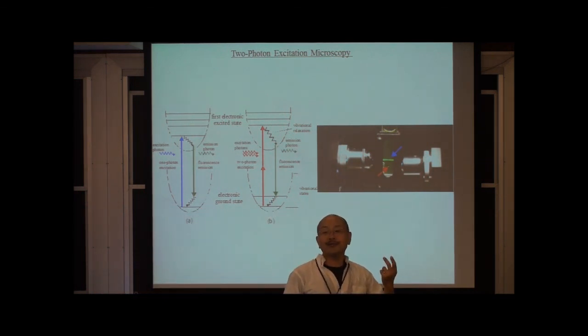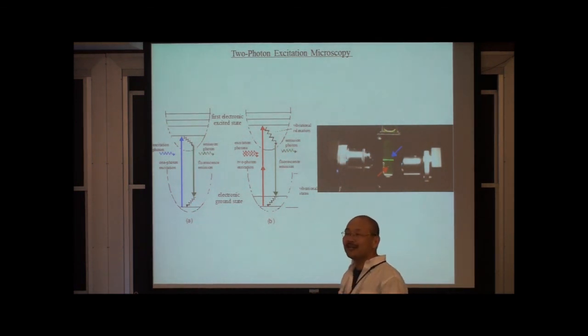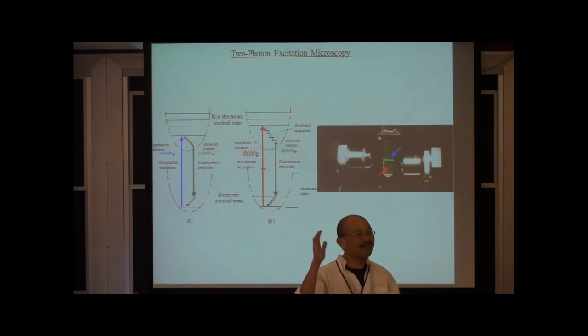You guys all used little lasers in the lab the last few days, including the little terrible blue laser pointer that generates terrible optical spots. But those are cheap laser pointers, $300. We decided to buy them so that we can do the GFP experiment for mostly this class.